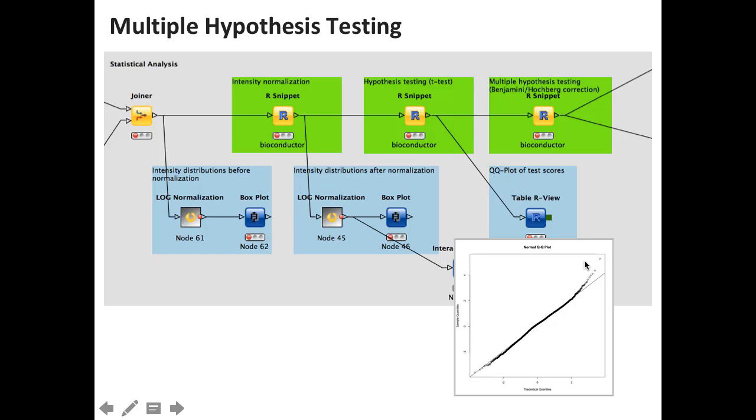And it turns out you don't need to identify that many metabolites. In this diabetes study, in the end, we had 17 features that were really statistically significant. And then you can just send the RT and m/z to the guys in the lab and ask them, well, look at the spectra and figure it out. I don't really care what it is. It's your problem now.